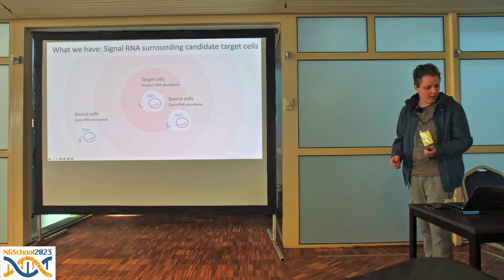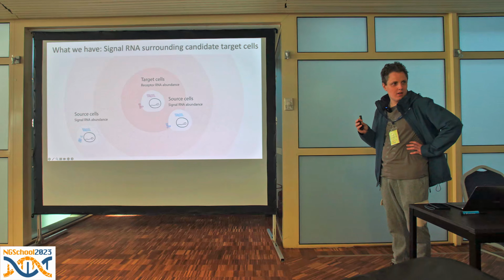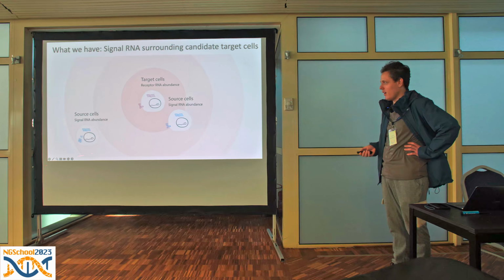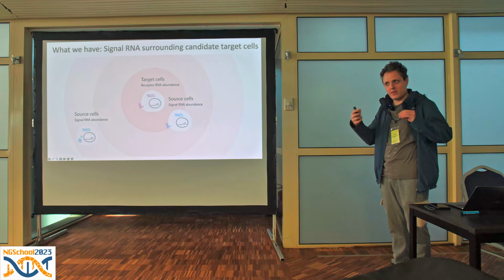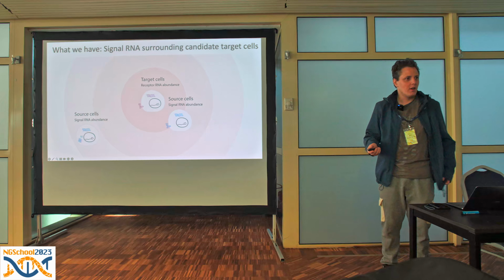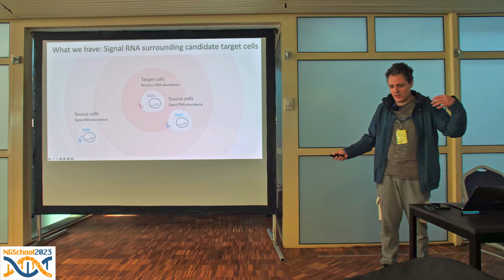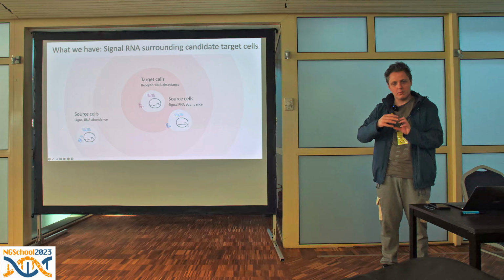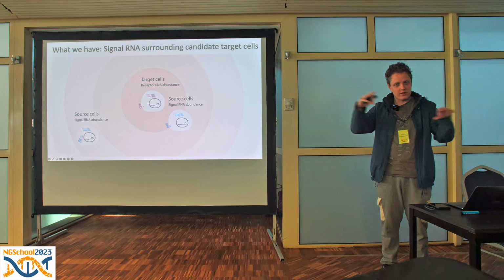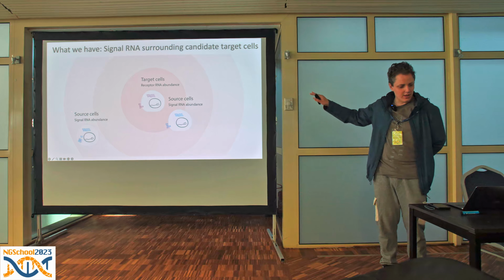Again, what I need to highlight is that when we are looking at spatial transcriptomics, not protein measurements, we are looking at transcriptomics. So what we see is this picture, and you have to overlay that knowledge, like your point about extracellular matrix, onto this picture, because this is the picture that you observe. So if you detect RNA abundance of extracellular matrix in source cells, this suggests a rough place of where those cells might be producing the extracellular structure of the tissue. But you have to think about this picture, that you observe RNA, in this type of manner.